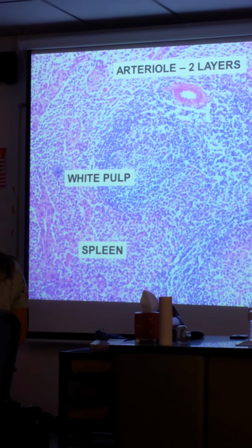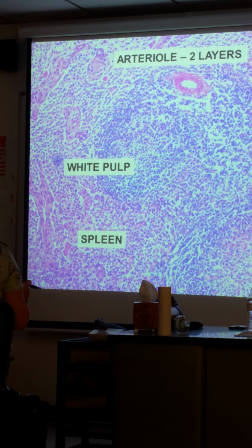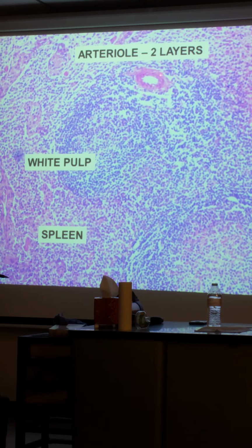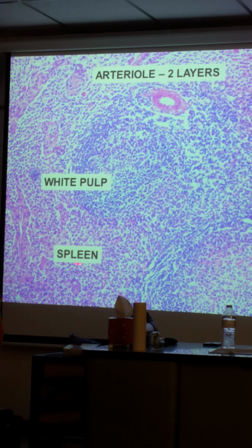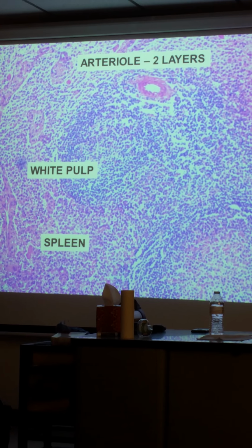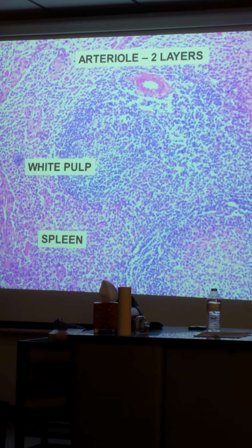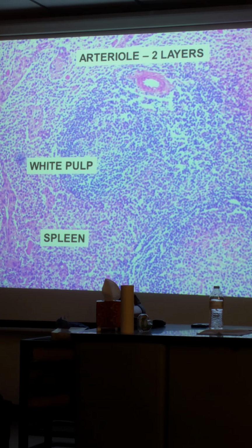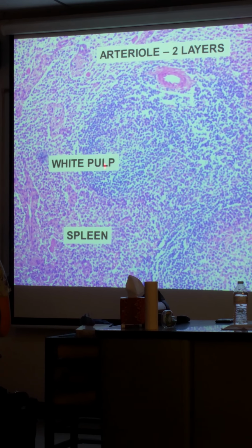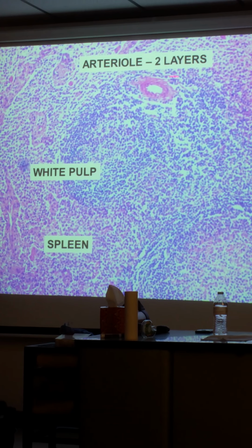We also have an arteriole from the spleen. I know these are arterioles by definition. These little vessels are called central arterioles in the spleen. I haven't taught spleen yet; that's with the immunity and lymphatics chapter. The spleen helps you fight blood-borne diseases because all the blood from the splenic artery gets filtered into these little arterioles, which are surrounded with white pulp.